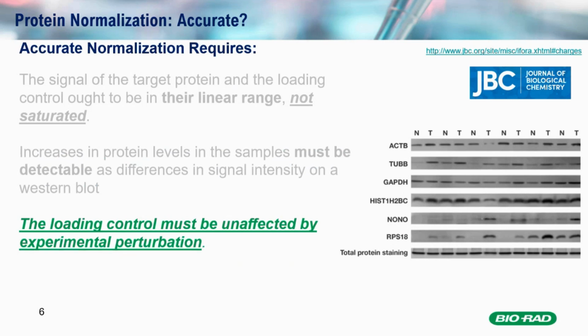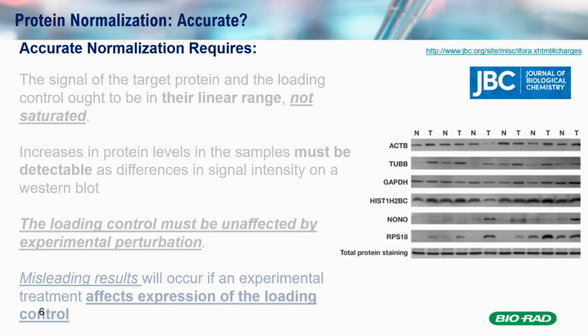And of course, the loading control must be unaffected by your experimental conditions. When you run your experiment and normalize your data according to the expression level of the loading control, if there is any problem, it will result in misleading results for your experiment.